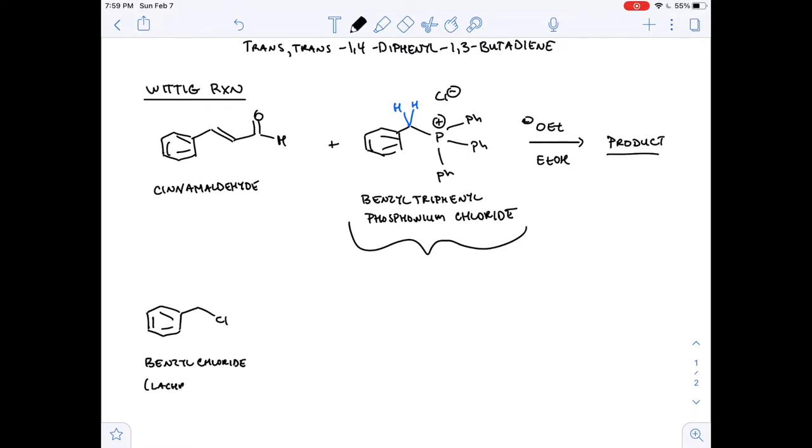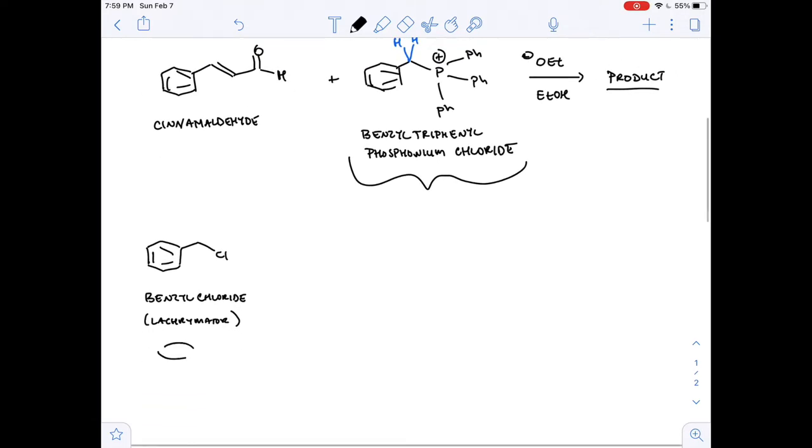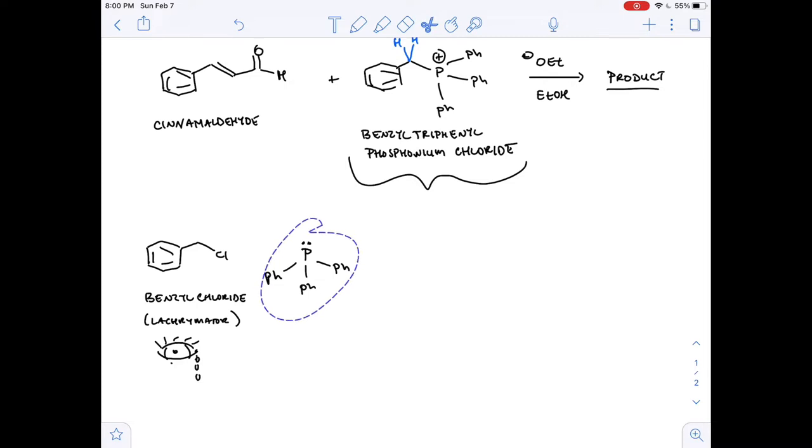All right, so how do we make that benzyl triphenyl phosphonium chloride would be the question. So we can start with benzyl chloride. Remember, benzyl chloride is a lacrimator, so we obviously want to be using these compounds in the hood because they cause irritation to the eye, okay? They cause tears, right? That's where the word lacrimator came from. And so what we do is combine an alkyl chloride with triphenylphosphine, okay?